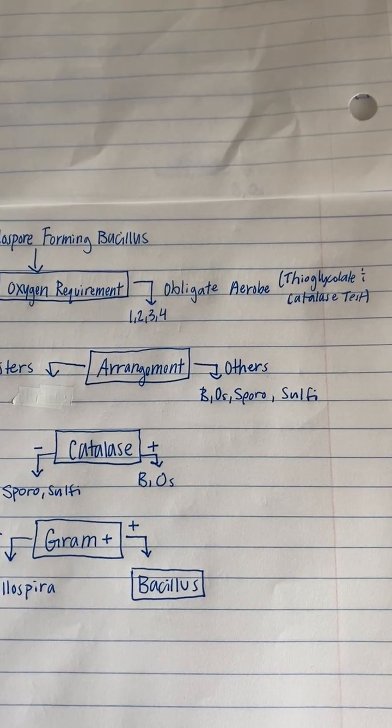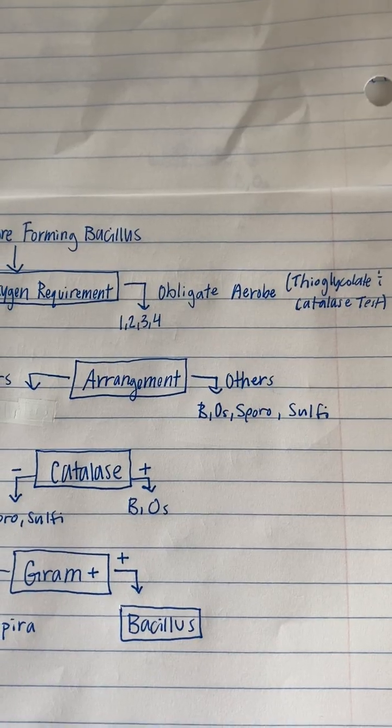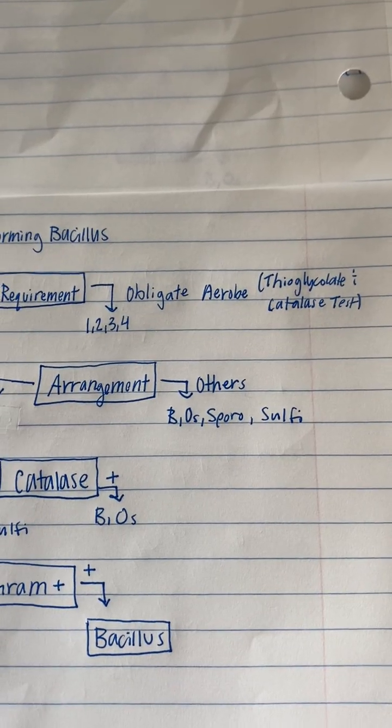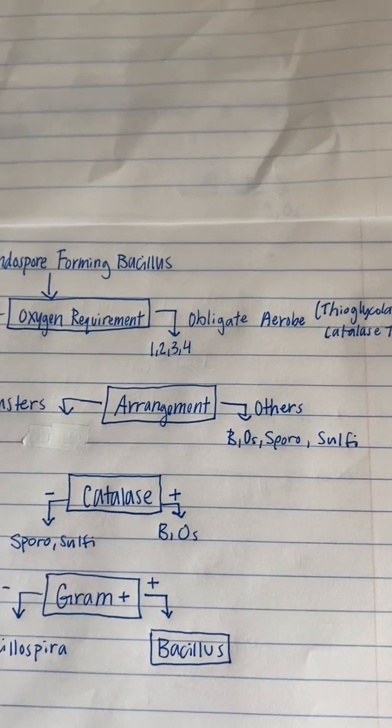But since the thioglycolate test had the cloudiness on the top, it was obvious that it was an obligate aerobe, and the catalase test was positive. We're going with that this microbe is an obligate aerobe.